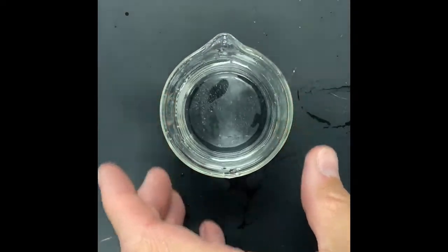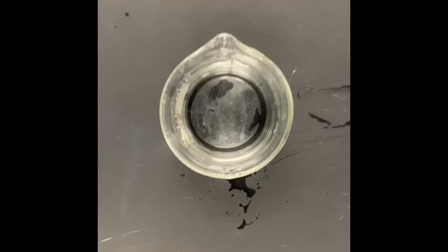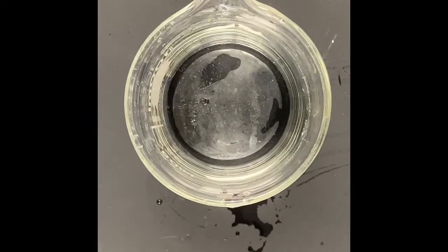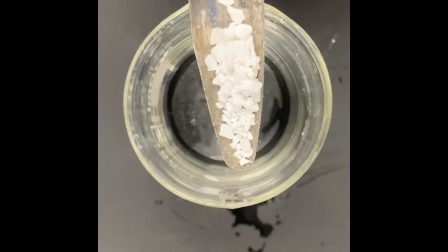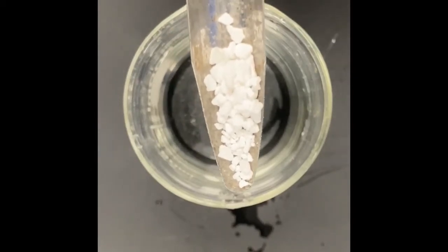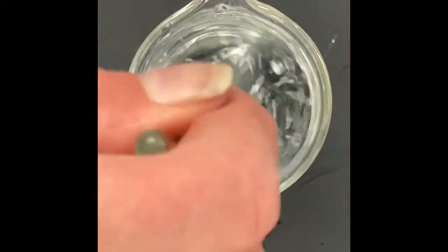And Mrs. Cho, again, what is solubility? All right, you guys, if you've heard of the word soluble before, things that are soluble dissolve in water. Things that are insoluble do not dissolve in water. So solubility is the test for that. So if you see that our substances are dissolving, you're gonna say yes. And if you see that they do not, you're gonna say no. First off, we have calcium chloride in your data table.